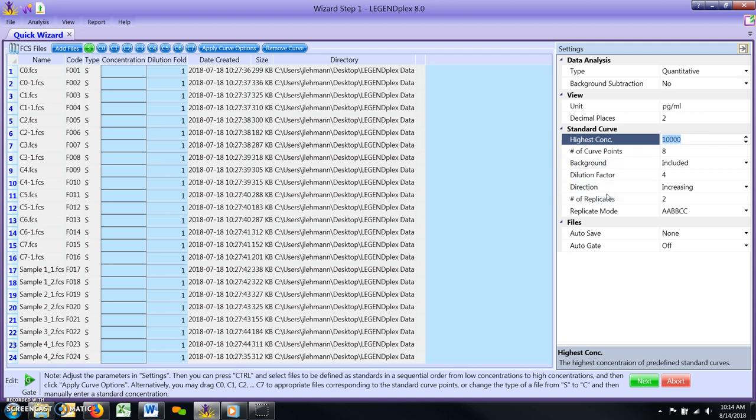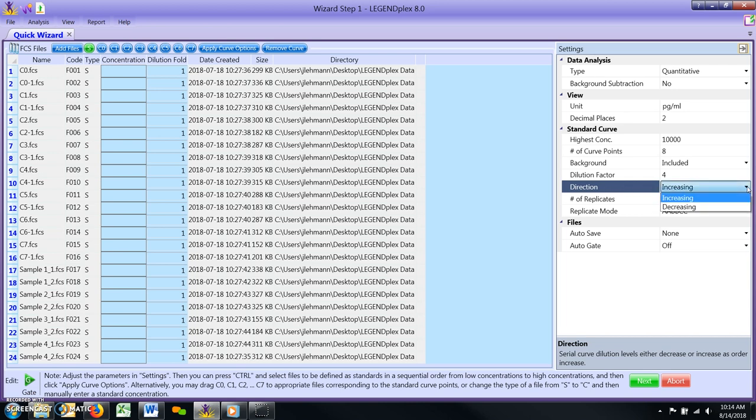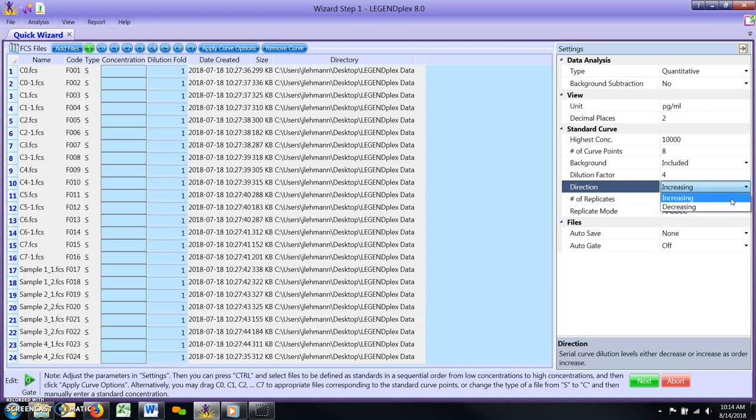Direction. This parameter setting informs the software whether your standard curve files are ordered on the Quick Wizard list from lowest to highest and thus increasing, or from highest to lowest, i.e. decreasing. Select the appropriate setting now.